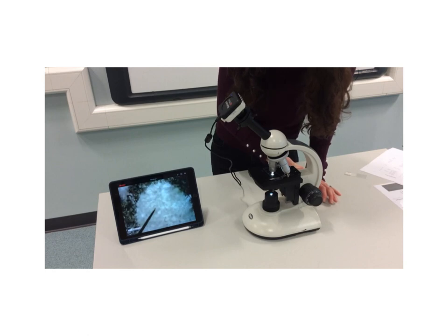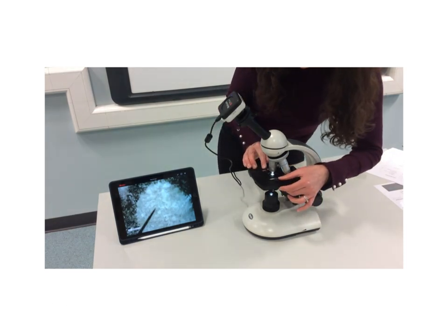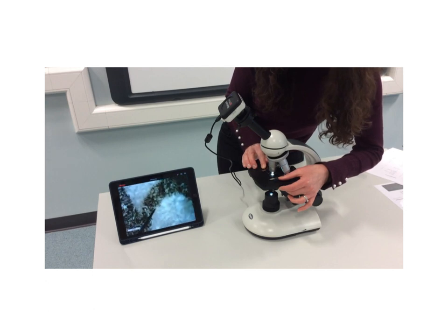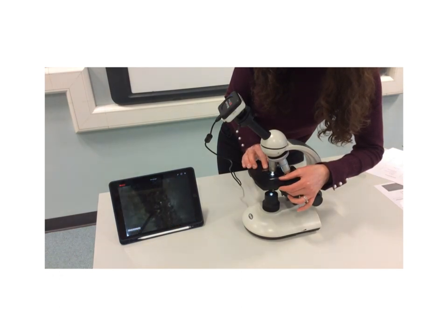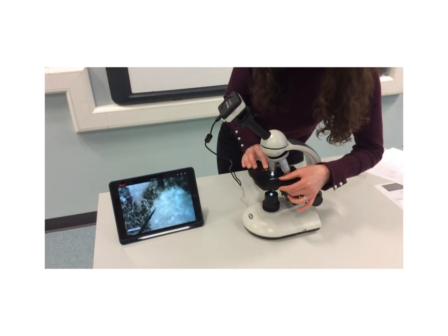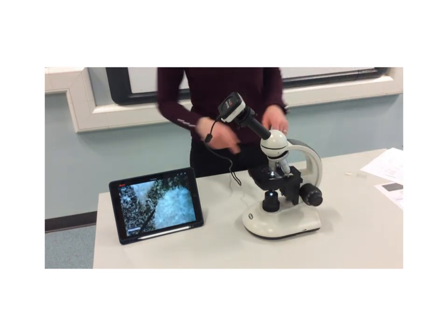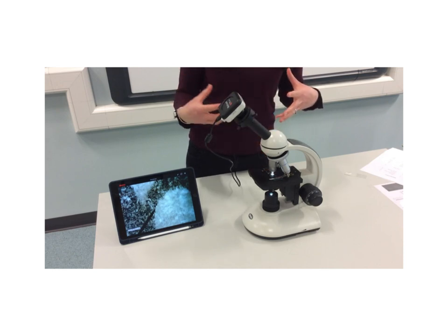So you can see it zoomed in even more. It will not fit as much in. Let me see if I can try and get a wee bit more of it in. So you can see as I move around there, there are the different parts of the letter. Okay, so there's the start of the tall bit of your H. But you can see that zoomed in, it's a much bigger image now, and that's because I'm on the medium power lens, so it's magnifying the image even more.